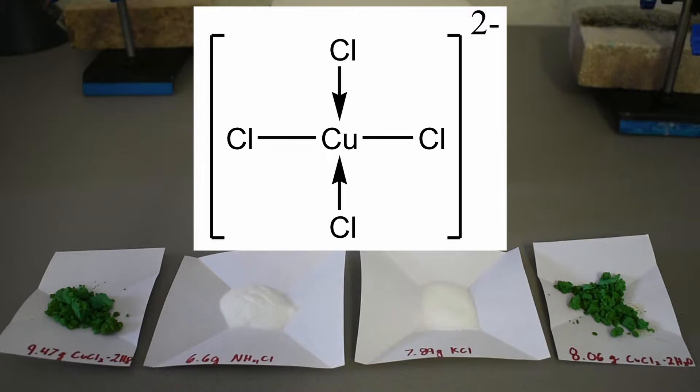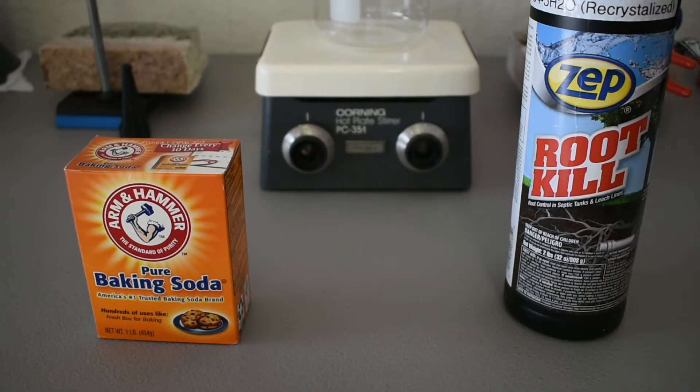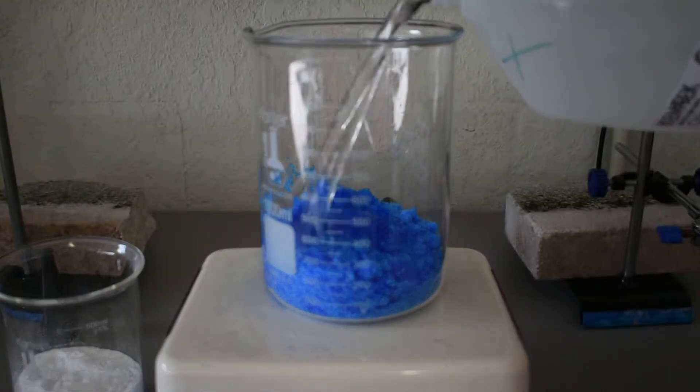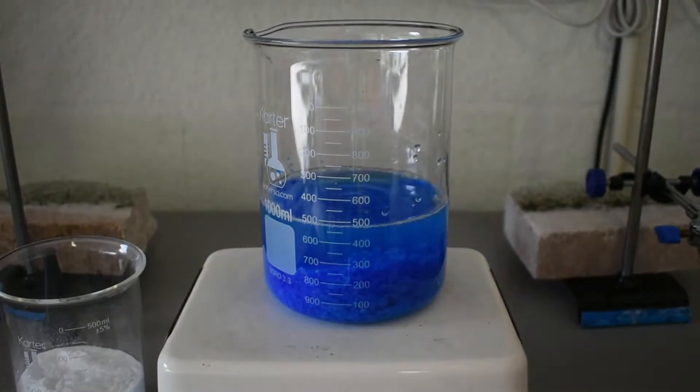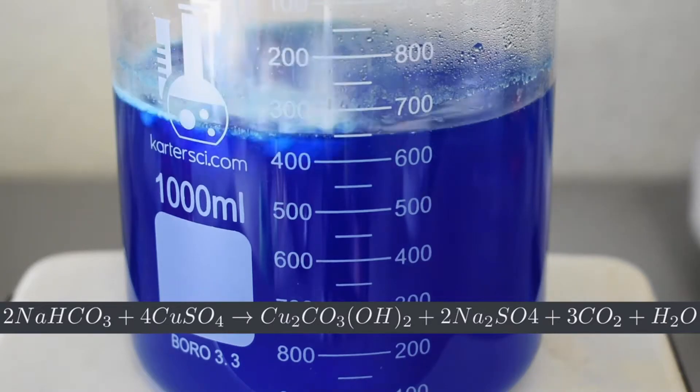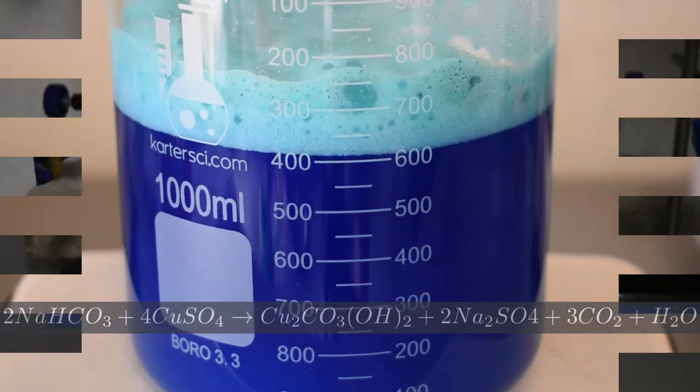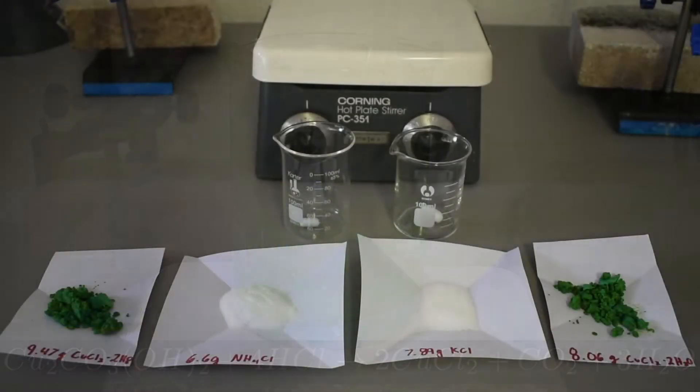And after doing more research, you can actually make salts from it, so that's what we're going to be doing today. The copper chloride is very easy to make. You can either put copper metal in HCl with hydrogen peroxide, or you can make basic copper carbonate or any other basic copper salt. You just add copper sulfate and sodium bicarbonate or sodium carbonate, and then you have your basic copper carbonate. Then you can add HCl to that to form copper chloride, and then you filter and dry that.